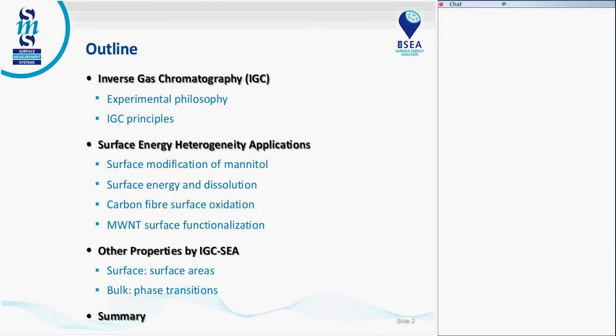So, just a brief outline. I will just very briefly talk about inverse GC, and then spend the bulk of this webinar going over some surface energy heterogeneity applications. That's the predominant use of inverse GC, several applications in a couple different fields, and then go over some other additional surface properties that you can measure by inverse GC and some bulk properties.